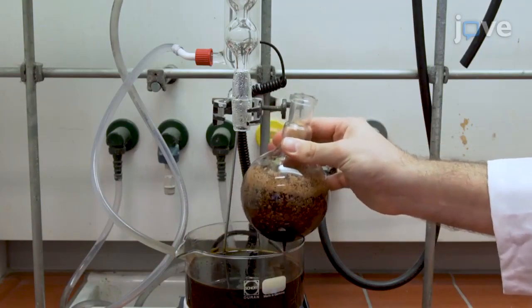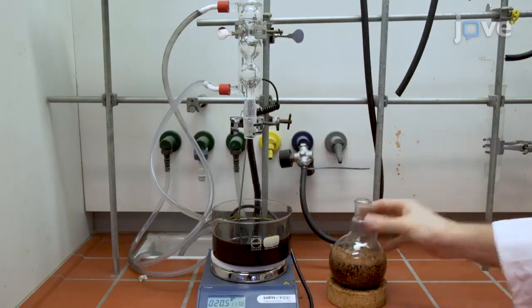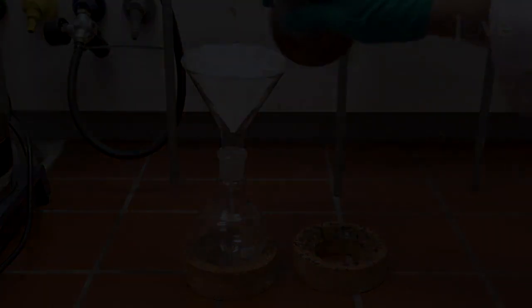After 2 hours, remove the flask from the bath to allow the mixture to cool down to room temperature, and strain the mixture through a 180 micron sieve.